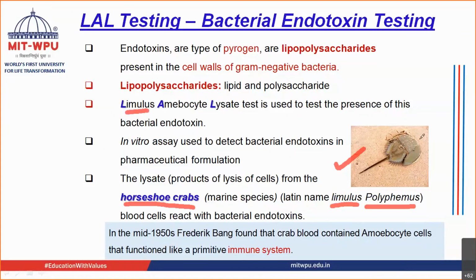From this marine species, you extract the blood and carry out the lysis of this blood. This lysate contains amebocytes.